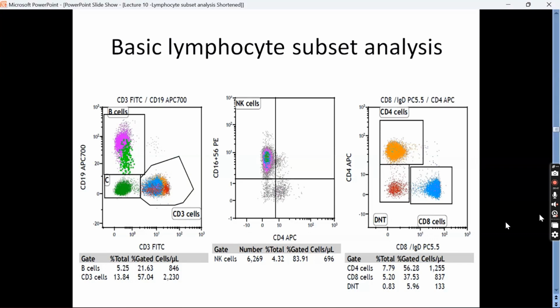Okay, to make it very clear, when you are doing it by the single platform method, that is, you are using the flow cytometer to give your absolute counts without touching your automated cell counter, you will be using something called calibration beads. When you are using the calibration beads, you should not wash the sample, because washing will lead to cell loss. So this is the single platform method. I've added beads and I've programmed in the software that the absolute counts are automatically given to me.